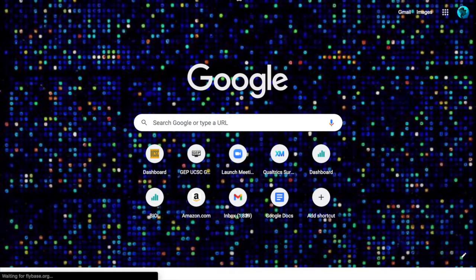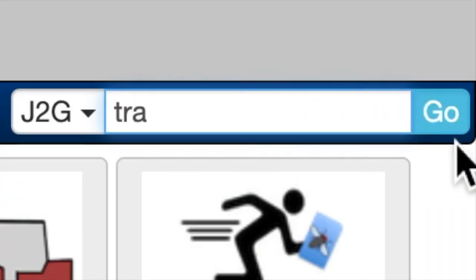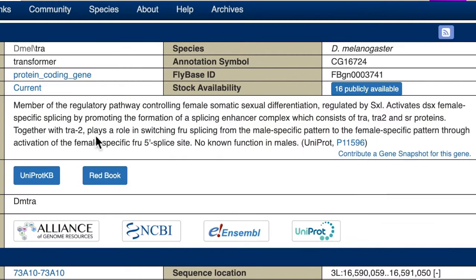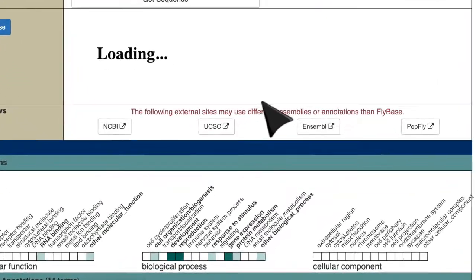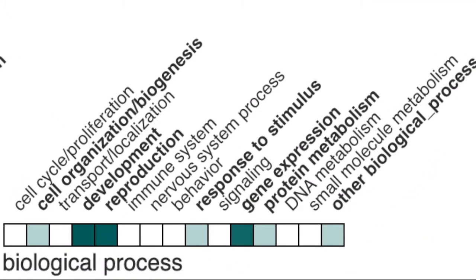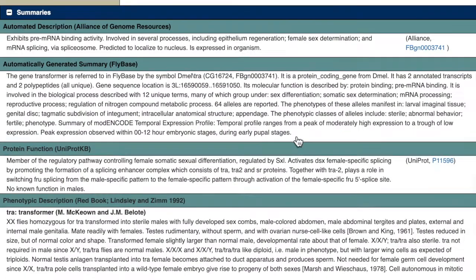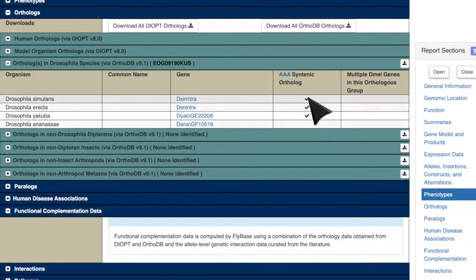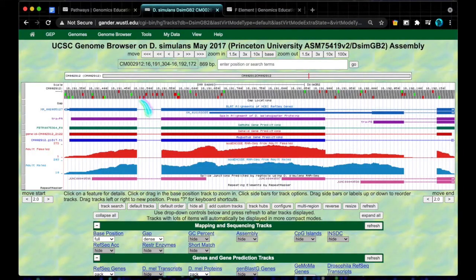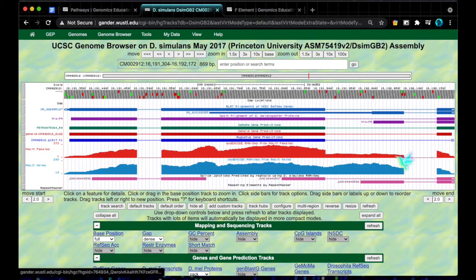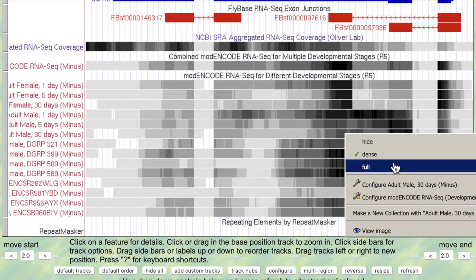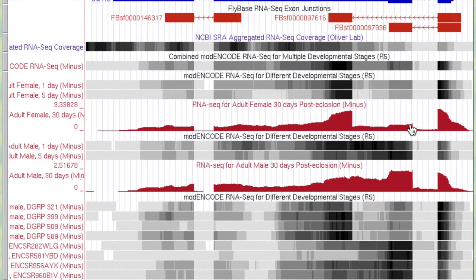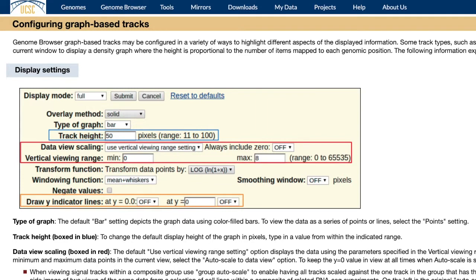Keeping with the theme of minding what you're analyzing, let's do a quick Flybase search to make some sense of these reads. Flybase gives you an extremely well-organized file corresponding to your assigned gene. After going through everything on here, I came to the conclusion that the transformer gene is used in both the formation of ovaries as well as the suppression of them, which would explain why even males express this gene that plays a role in ovary production. Without knowing the full extent of its role, you might have been confused as to why males express it nearly as much as females do.